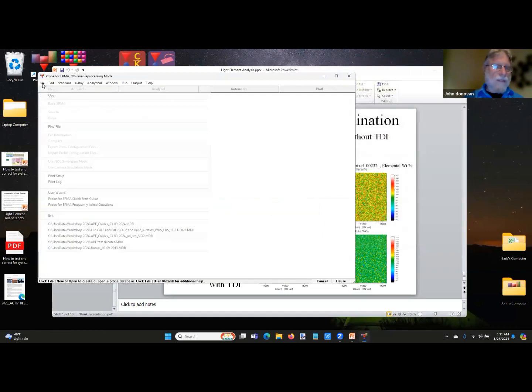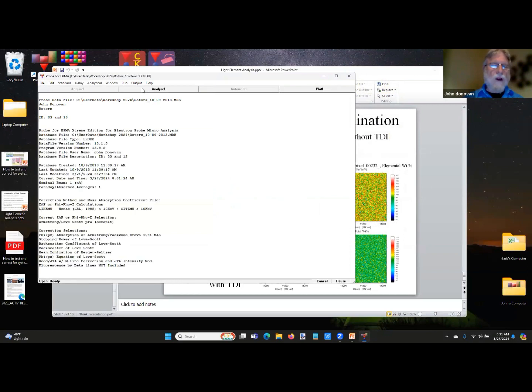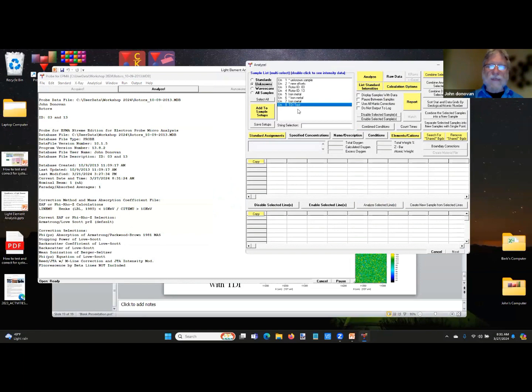And then finally, let me open up this. I want to show you the interference correction thing real quick. So, measuring carbon, these are some commercial work we did.